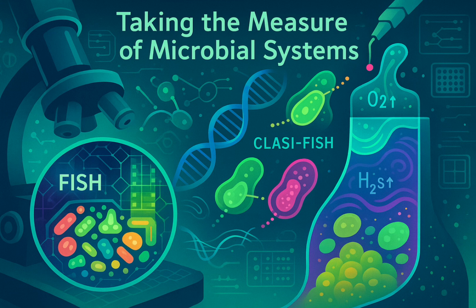Okay, so let's say you do get something growing. You still need a pure culture, right? Just one type of microbe. What are the standard ways to get that isolation? Yeah, the classic methods involve dilution and solid media, usually agar plates. The streak plate is probably the most common, right? You dilute the culture and spread it out so individual cells grow into isolated colonies. Each colony from one original cell, ideally. Ideally, yeah.